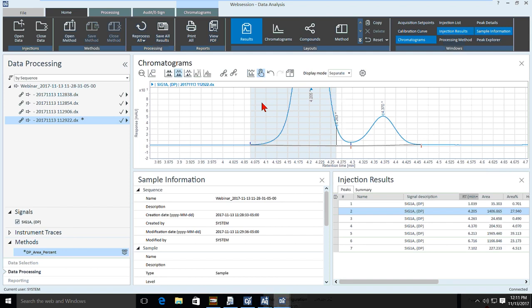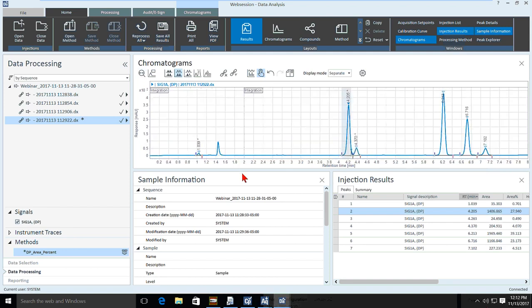Okay, so if I zoom out, the indicators are, let me deselect this. I now manually integrated this first one because I have an asterisk on the first one, and I now manually integrated these two because they now have asterisks, and this file itself was integrated. So that's the indication of what's been integrated, and that's what you can easily see.